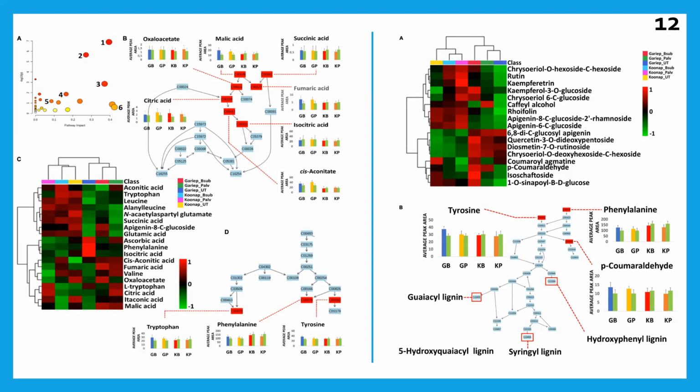Okay, awesome. All right. So looking at our data, a positive correlation was observed between PGPR treatment and the accumulation of phenolic compounds in plants. Right. So this is looking at the figure on your left, figure D, which outlines the biosynthesis of one of the amino acids, which are mostly essential for the beginning of the secondary metabolism. And this goes to the figure on your right, in figure B, where the phenylpropanoid biosynthesis pathway is shown.